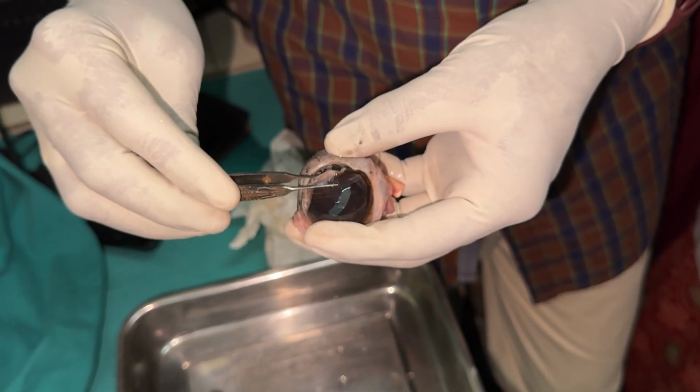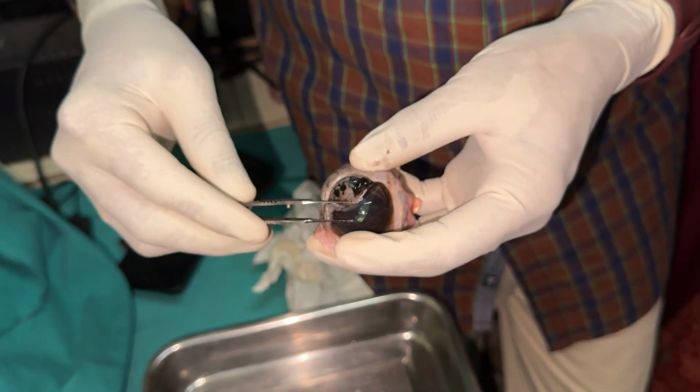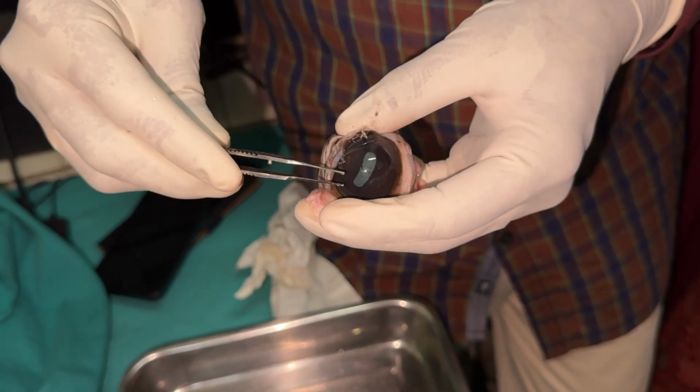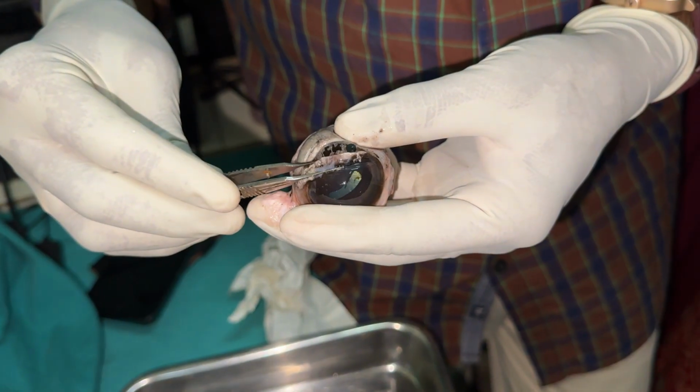You see the iris. This is the iris muscle. These black structures are the iris muscles. This is the cornea.